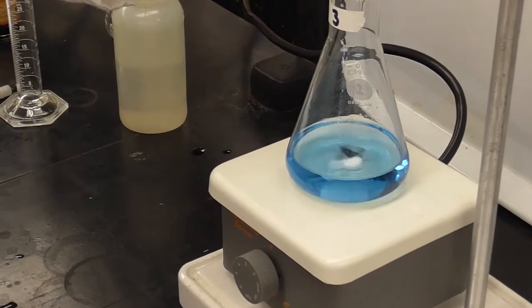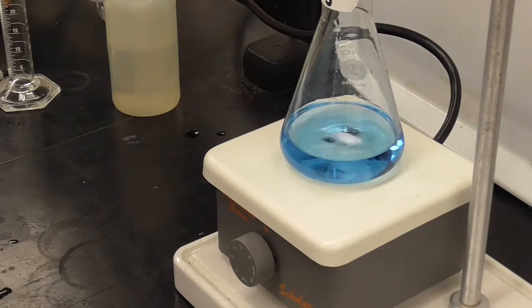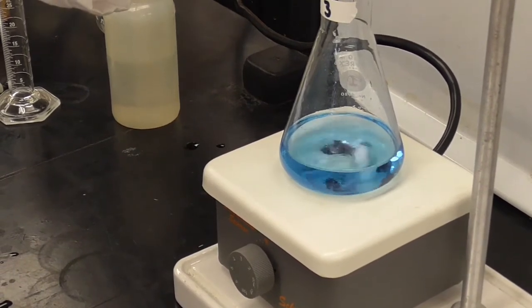Okay, we're close to the endpoint now. And so we're going to watch for that green to yellow, blue to green to yellow transition.